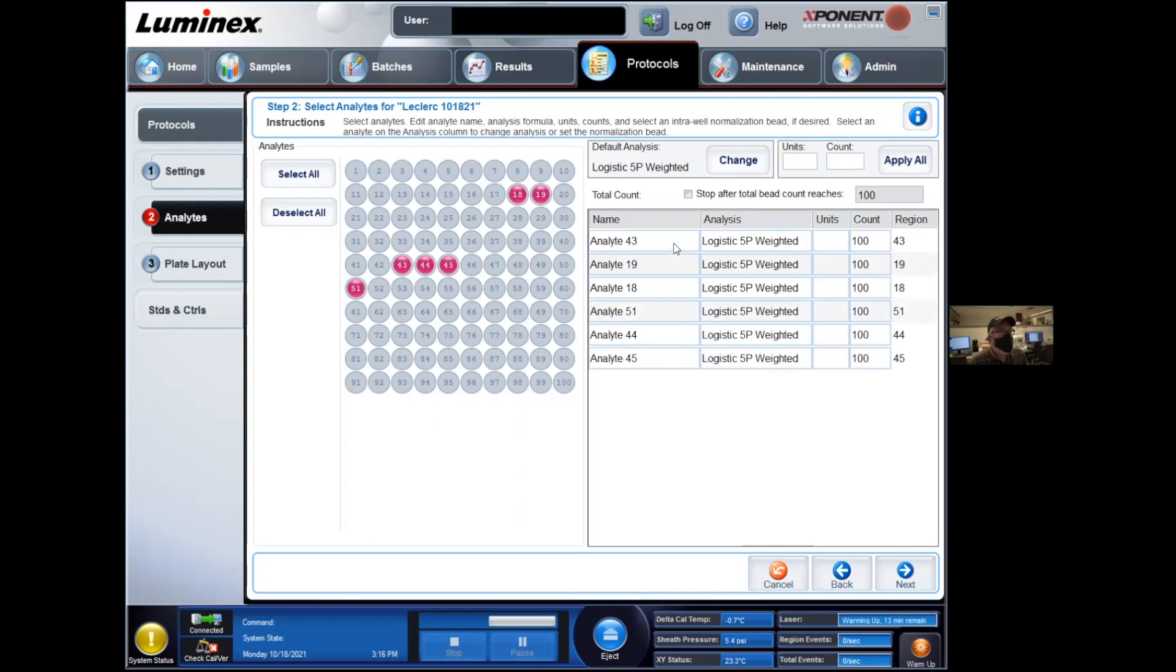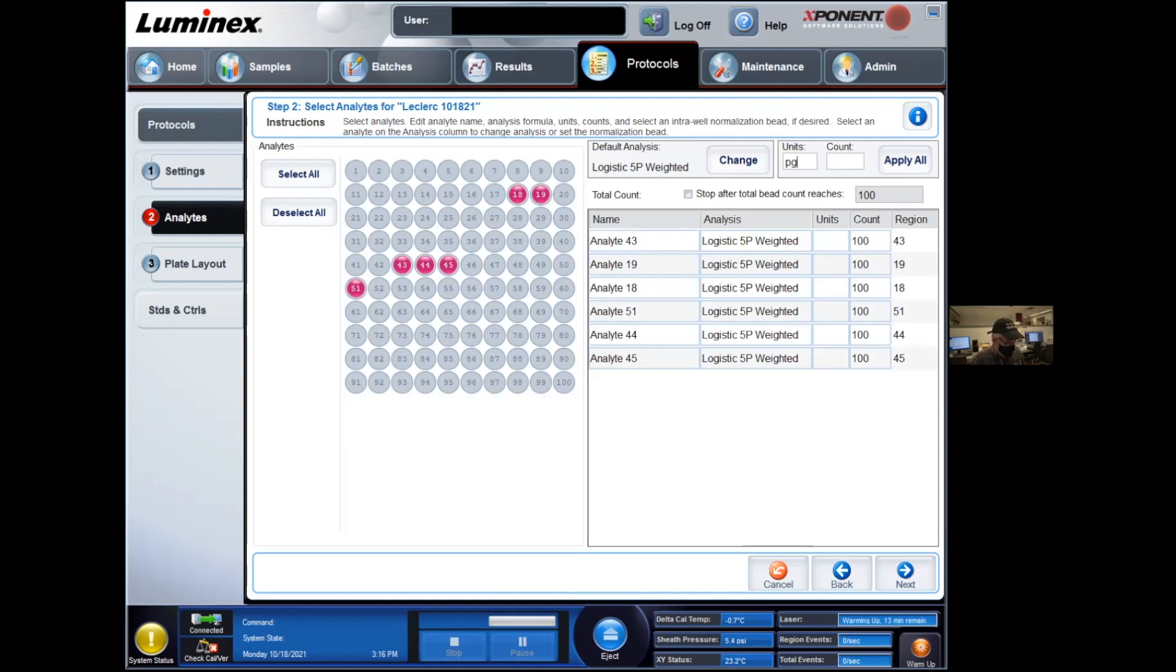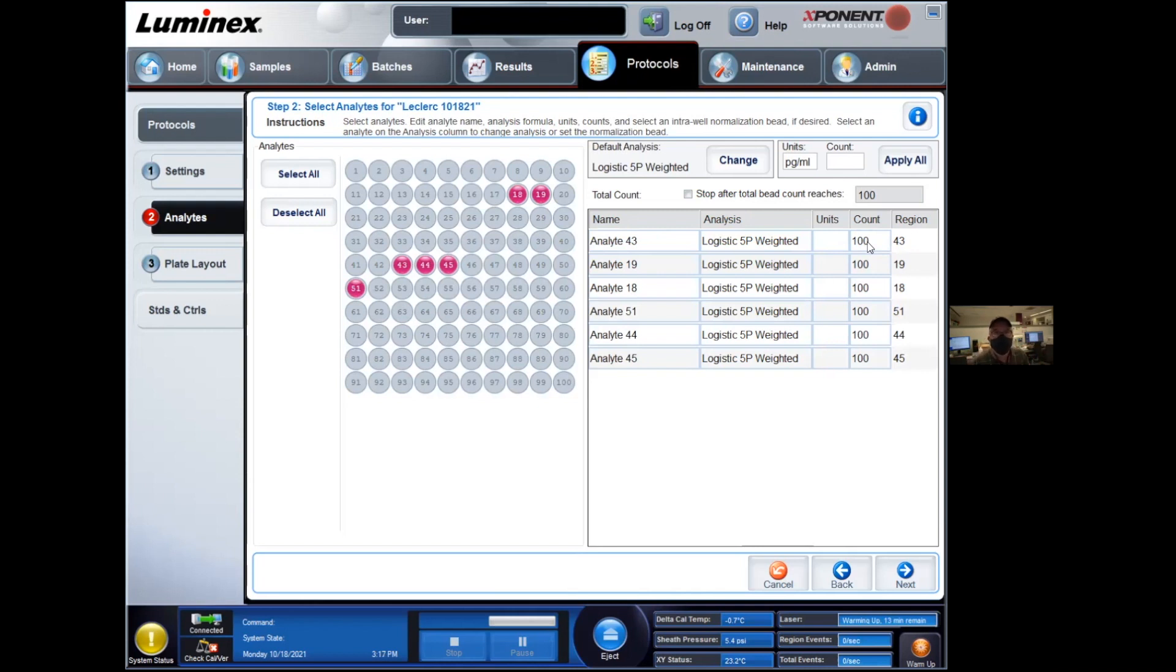At this point, you can go ahead and rename everything, enter the units. In general, it's going to be picogram per milliliter. And the count, it depends on your protocol. Typically, it's either 50 beads per analyte or 100 beads. Again, the software will try to reach that threshold before it moves on to the next well.